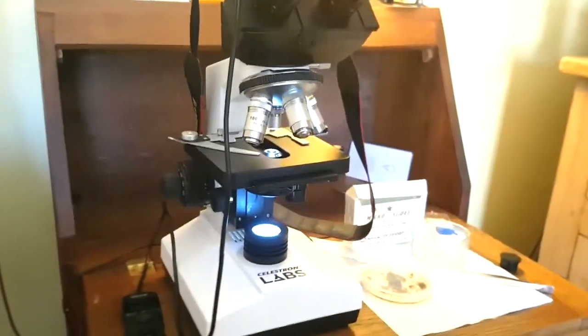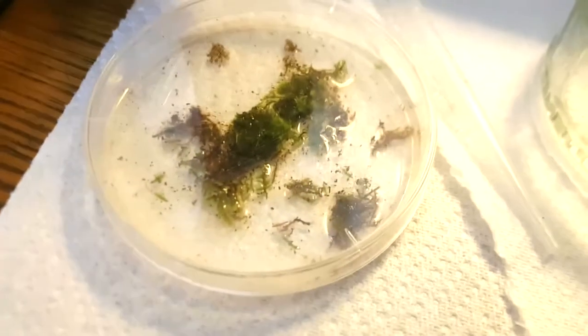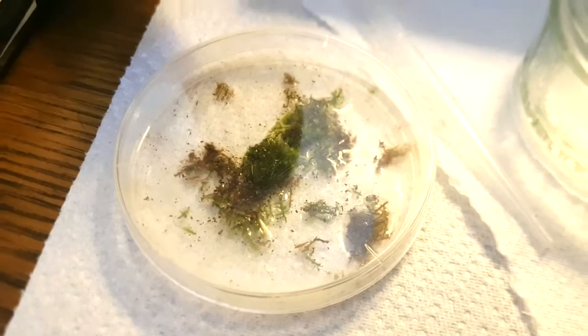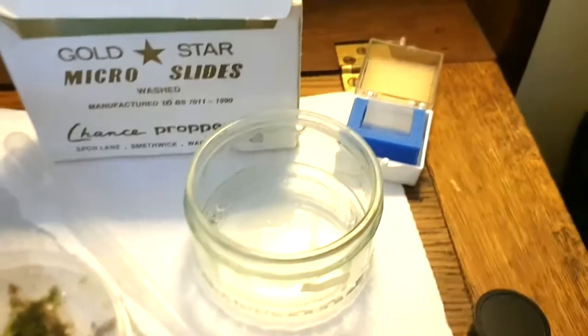So it's the next day and the moss has been left overnight and most of this afternoon. So it's been there a good while, almost 24 hours now, and it's just been sitting there. I haven't touched it. And I'll show you how I transfer that onto microscope slides in a second. So I've got a pipette and some microscope slides and cover slips.